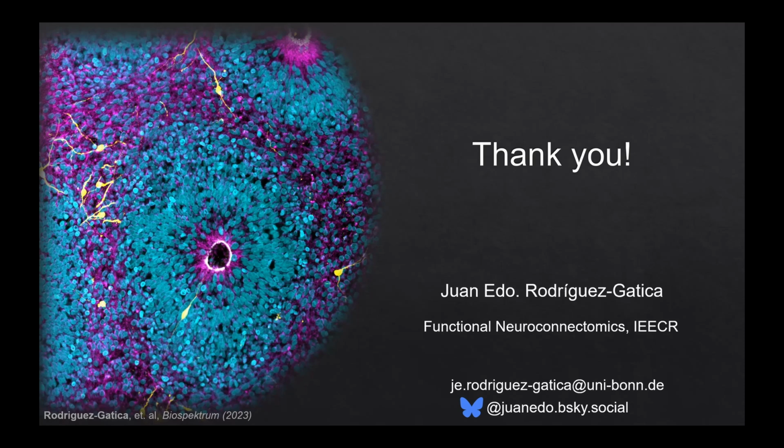Yes, I have a question. Good morning. Thank you very much for your talk. I'm wondering if you are able to measure the expansion factor and the distortion problem by imaging the DAPI before expansion, because I am doing expansion of the whole lymph node, and now I am doing the imaging with light sheet, but it's very difficult for me to make an image before expansion precisely because I'm using the light sheet and there is a lot of scattering before expansion. So how could you do that?